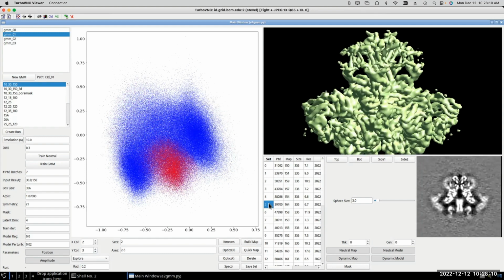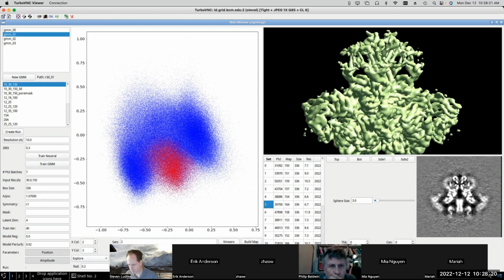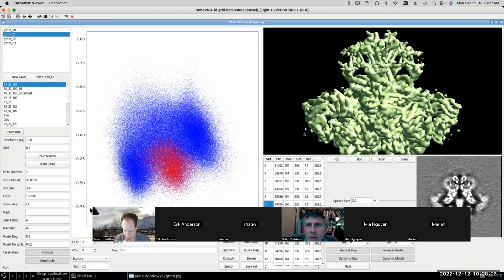So Steve, is it possible this analyzer is able to study any particles or features without a certain structure? For example, like a membrane.